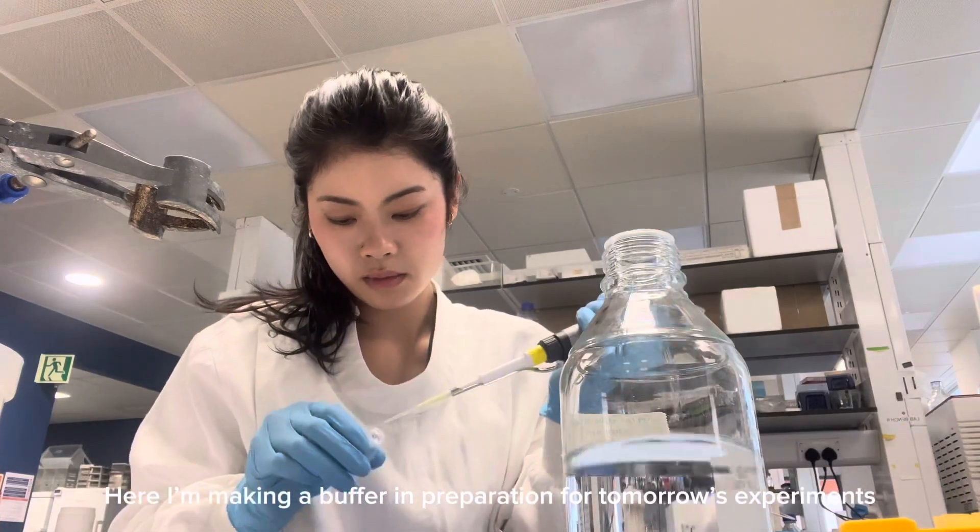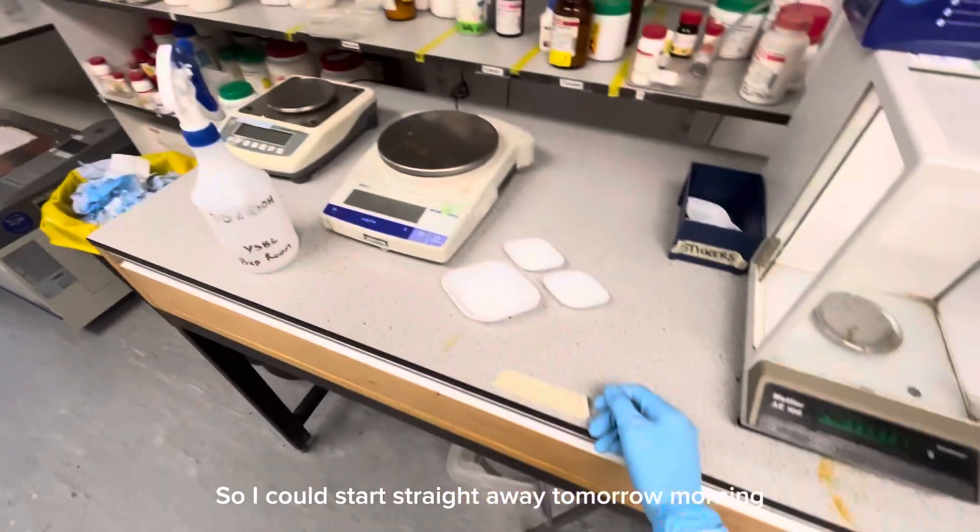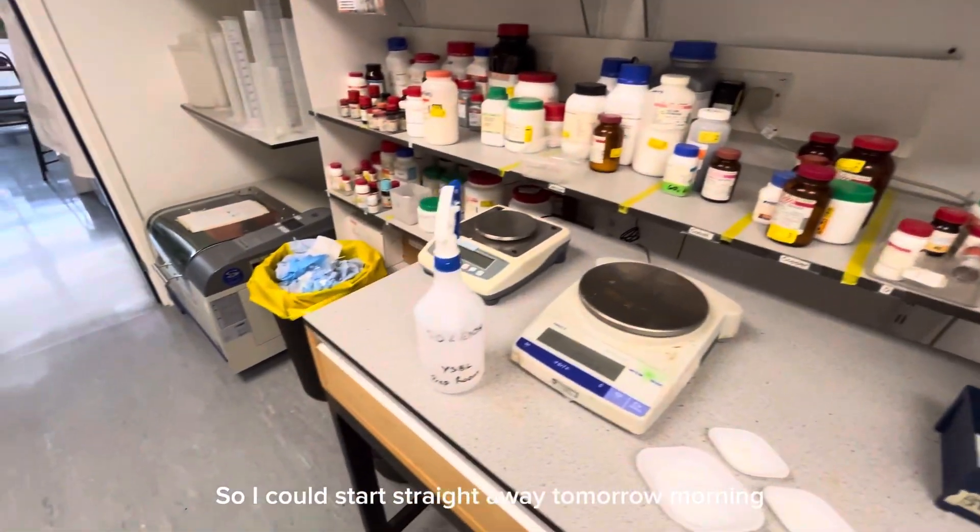Here I'm making a buffer in preparation for tomorrow's experiment, so I can start straight away tomorrow morning when I come back.